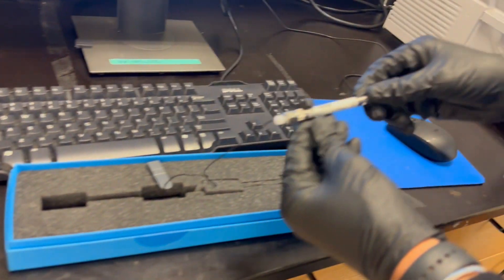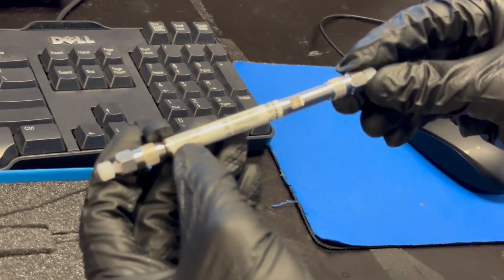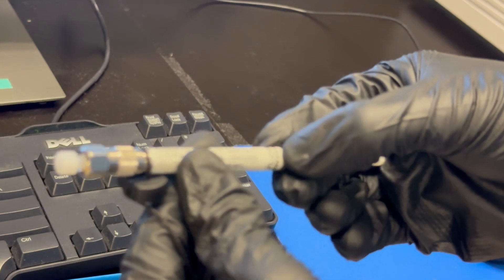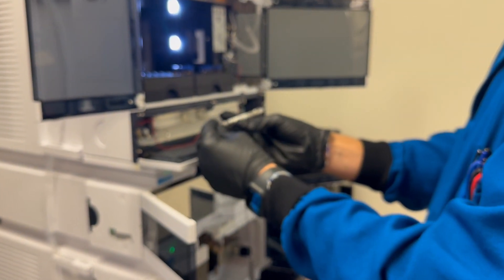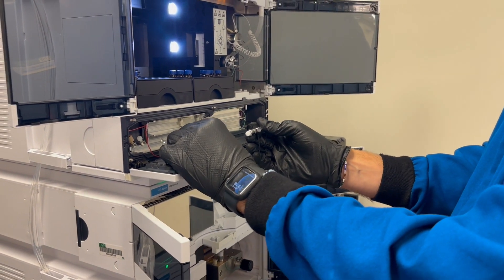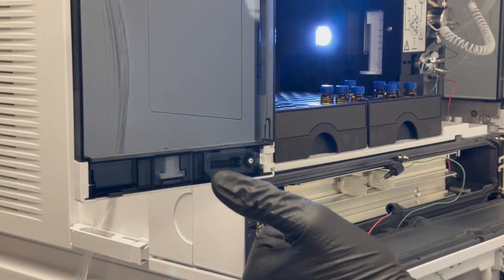Here's our column — it's the Poroshell EC120 C18, and all of the different packing details are there. Notice how there is an arrow that says 'direction of flow,' so this will be your inlet and this will be your outlet. From here, you're going to want to first identify which one is your inlet. In this LC system, the inlet is always going to be on your left-hand side going towards the right-hand side.